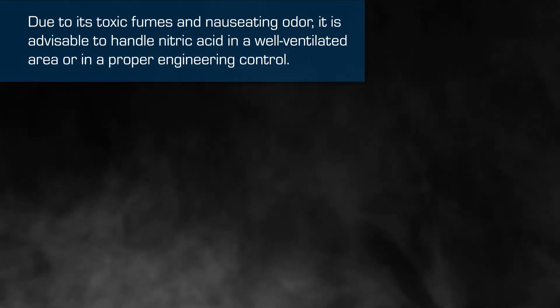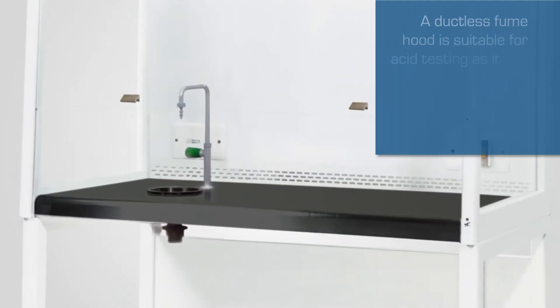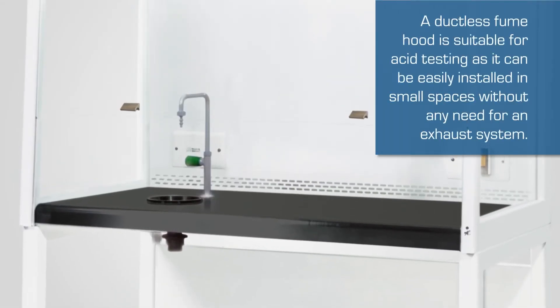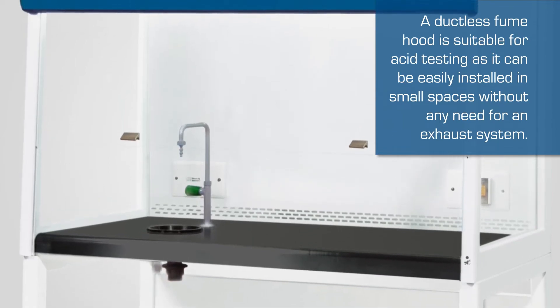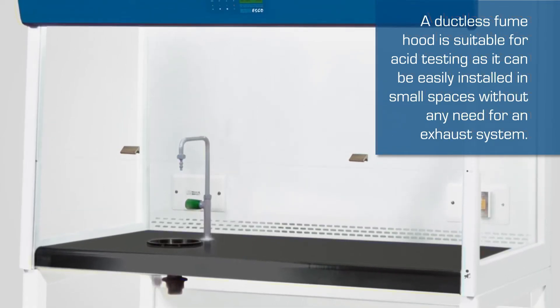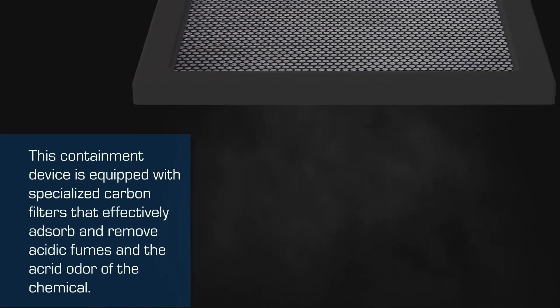A ductless fume hood is suitable for acid testing as it can be easily installed in small spaces without any need for an exhaust system. This containment device is equipped with specialized carbon filters.